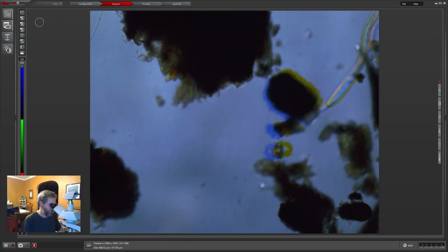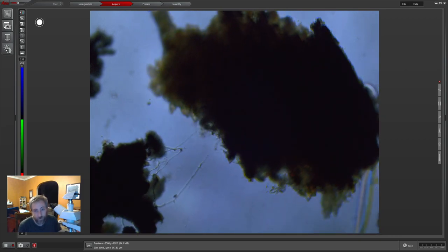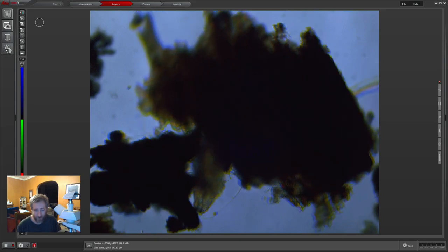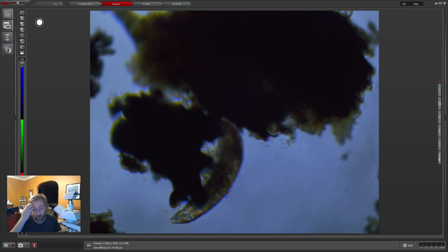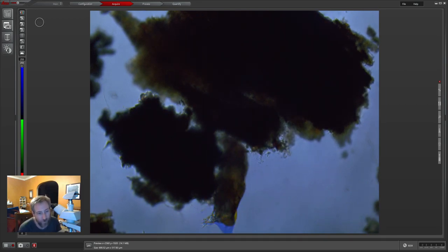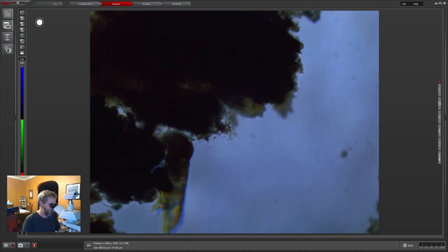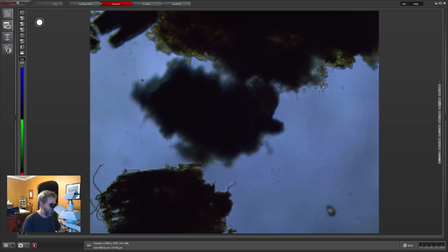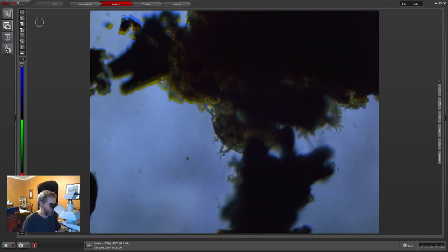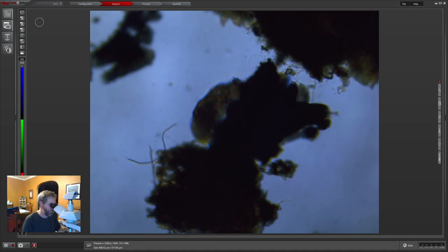I found a big one and we watched it for a while, and then I found another one that was eating a nematode, so I transferred that one onto the coverslip. Then I made another batch of sample from the same material and found the eggs and this water bear in the same little droplet. I thought, well, this would be fun to stream. I haven't done a night stream from the microscope for a while, and Sylvia has gone to bed so that adds a lot less chaos. So I thought I'd do a short little stream highlighting the little water bears.